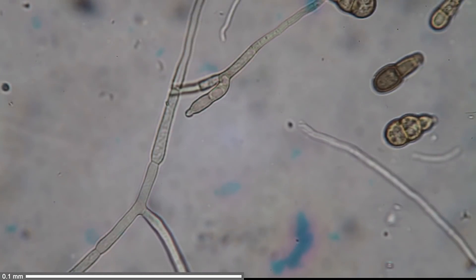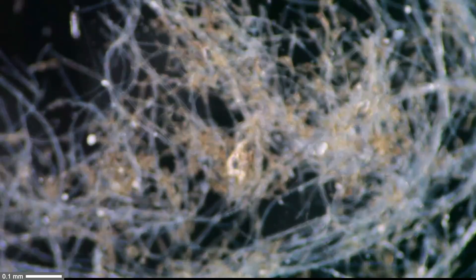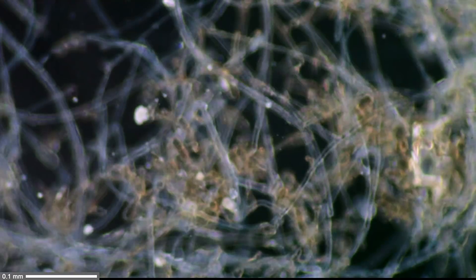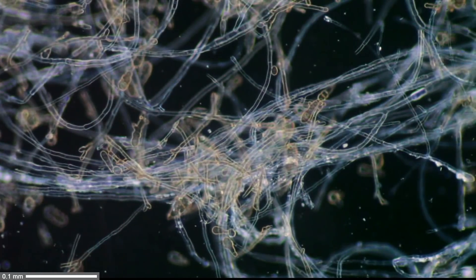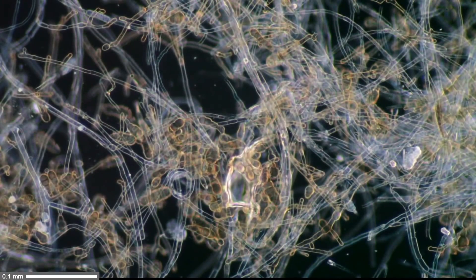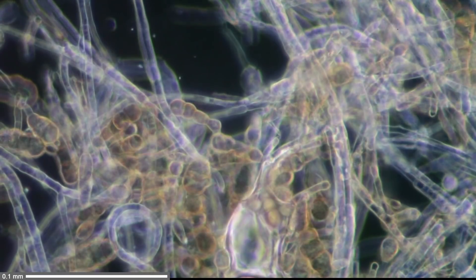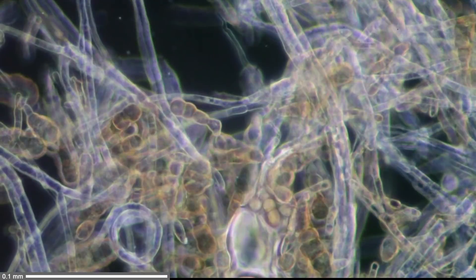At the top right you can see the conidia appearing. I've now added the dark field patch stop, which makes the fungus appear bright on a dark background. At slightly higher magnification you can see that the fungus is a little bit pigmented and the conidia have a slightly yellowish, light brownish color. However, at higher magnification the image quality breaks down a little in dark field — the dark field patch stop size needs to be in agreement with the objective, and in this case it's a little bit too small, but these are technical details.